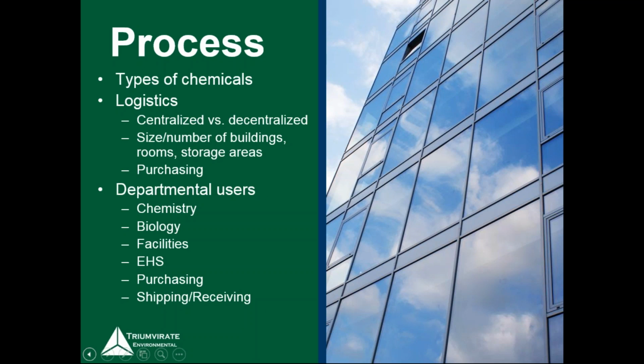Do you want to do just hazardous chemicals? Do you want haz and non-haz chemicals? Do you want to get into consumables, things with high turnover rates like kits? How deep do you want to dive on that? We'll talk a little bit more about that in a minute, but figuring that out in the front end is pretty important.